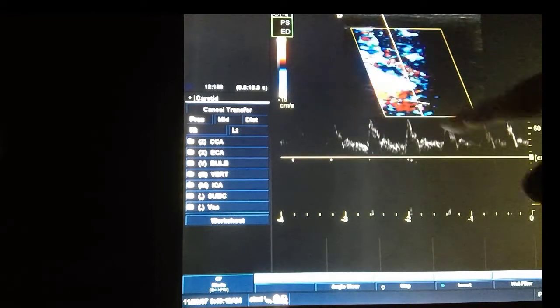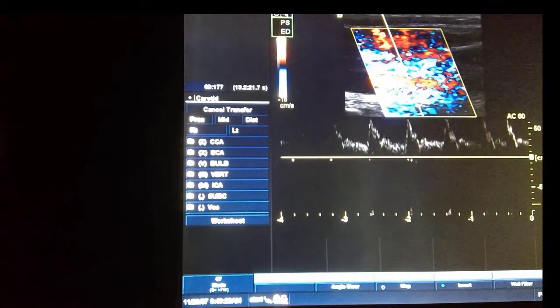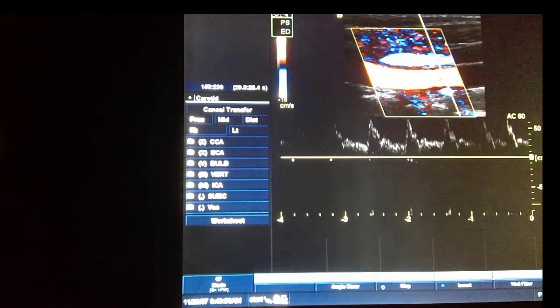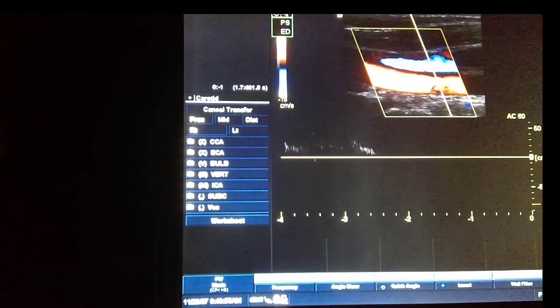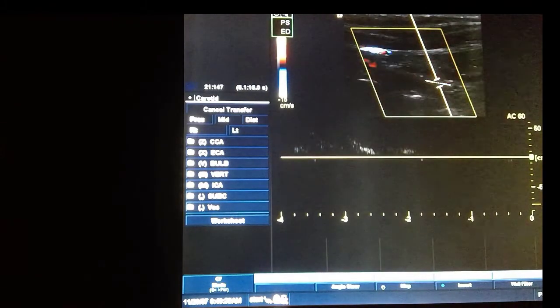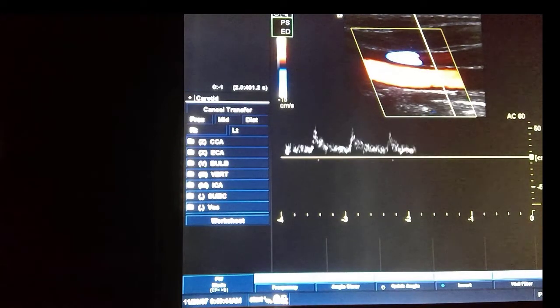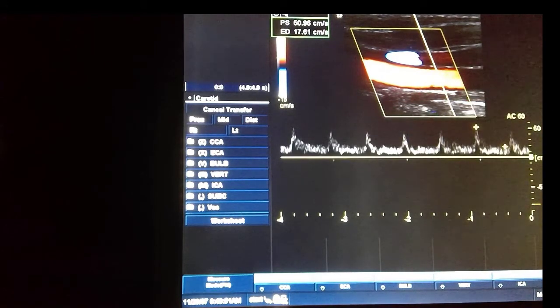We're getting a little bit of aliasing. We can see that the tops of the peaks are getting cut off. Now I'm going to change how it's angled so that brings that area that I was interested in closer to where we were. And that's the best example, but we can see now that we are no longer as close to the peak.